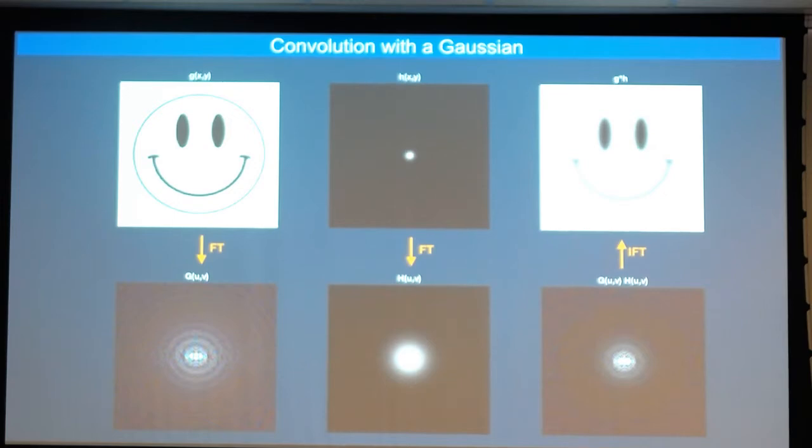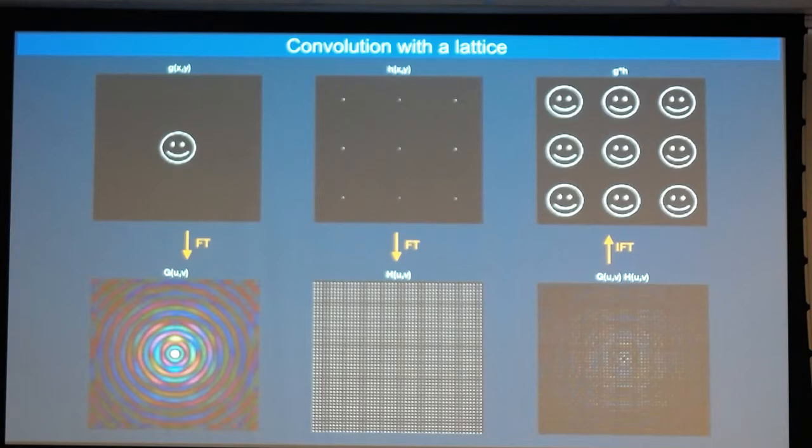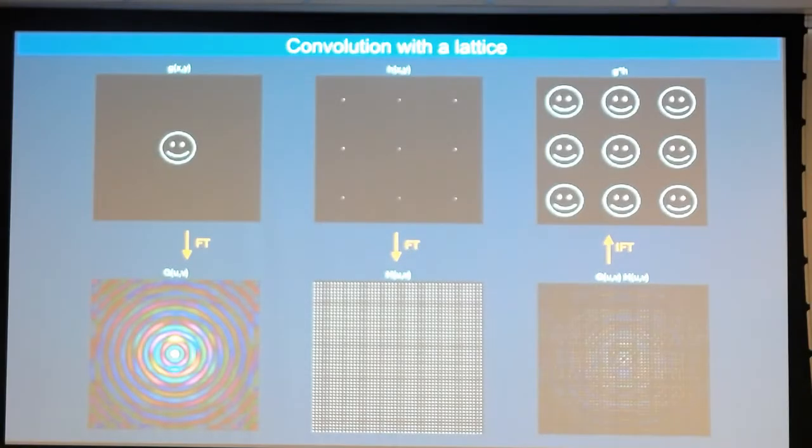When I do the inverse transform, I get that. The surprising thing is that there's a really, really good algorithm for doing Fourier transforms on a computer. Believe it or not, it's faster to do this operation than going straight across by orders of magnitude, really. But that's just under the hood.